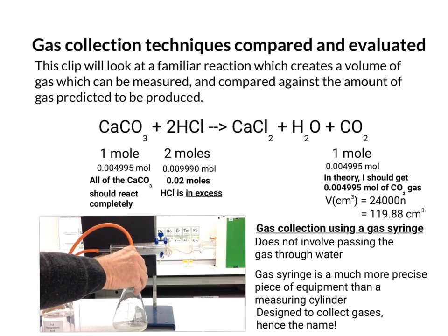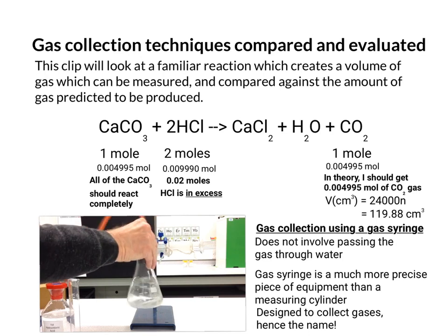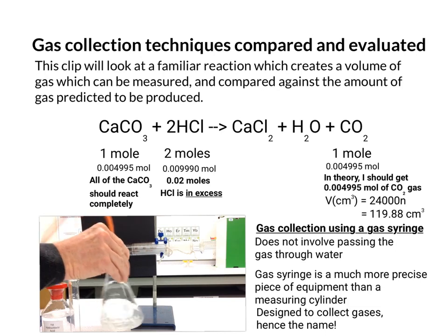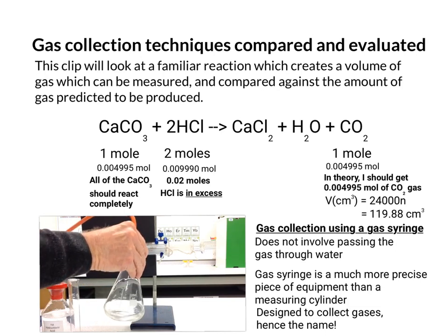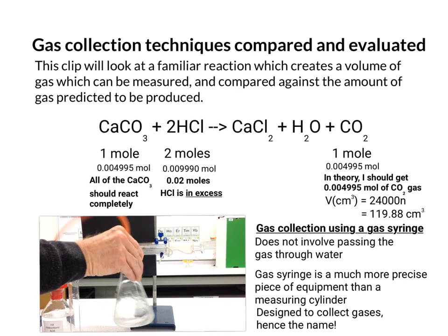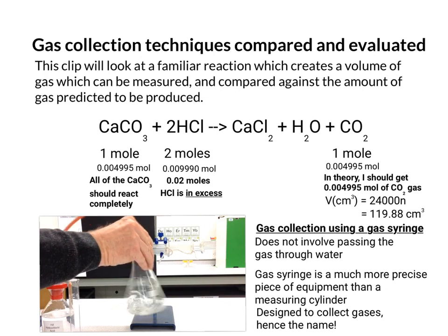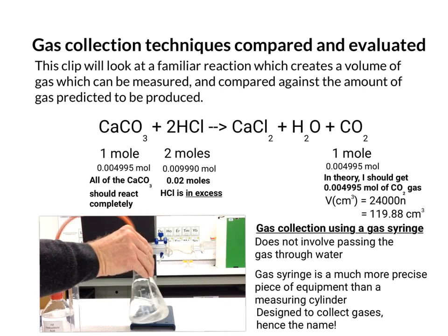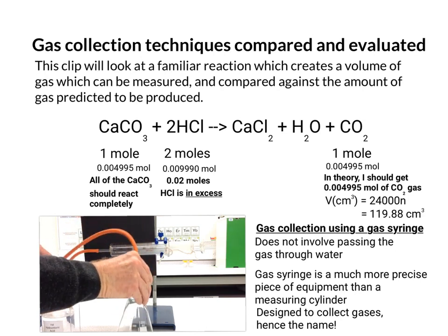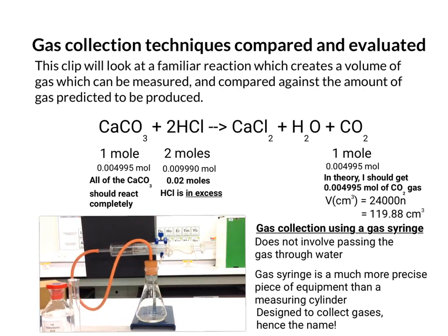So you can see that even now there's slight jerky movements that show it's picking up a little bit of extra gas. So it's much more sensitive, this piece of equipment. So I don't know if you can see in the background when I get my hand out of the way. So just before we do that, checking it's gone clear to make sure all of the calcium carbonate is dissolved and reacted. So you can see it's gone a bit closer to 60 if you squint your eyes a bit.